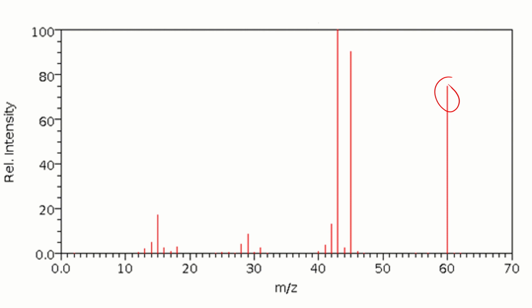So if I flip back over to the mass spec graph, I can see my peak at 45: 41, 2, 3, 4, 5. There's my peak at 45. I can see a peak at 15 right here. I can see a peak at 43, 1, 2, 3. That's this base peak here. It's the whole thing minus a hydroxide. And that is all the peaks I need to identify to clinch the fact that I am dealing with an ethanoic acid.